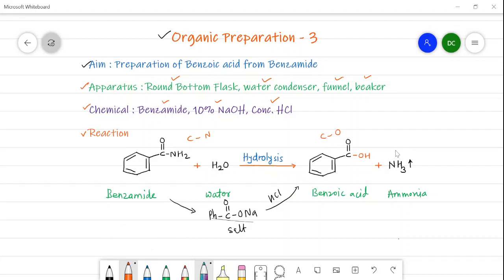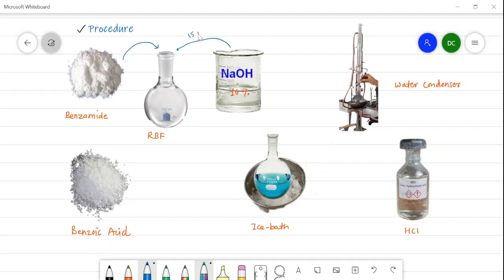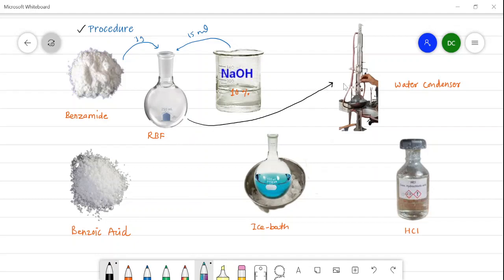Before the actual procedure, note that there is an evolution of NH3 — keep that in mind. The pictorial representation shows: benzamide, round bottom flask, NaOH, water condenser, HCl, ice bath, and so on. In the actual procedure, one gram of benzamide and 15 ml of sodium hydroxide are taken into the round bottom flask, which is then heated with a water condenser attached for about 30 minutes.